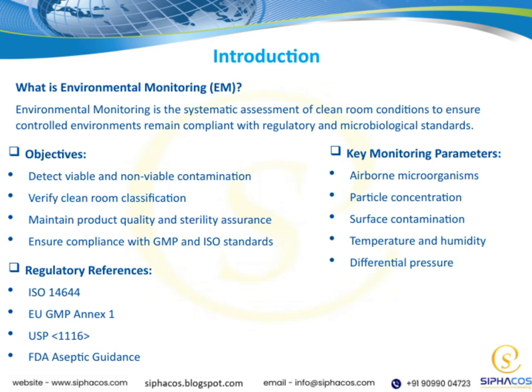By monitoring effectively, we help prevent contamination that could impact product safety. And of course, compliance with GMP and ISO standards is essential to meet regulatory requirements and ensure consistent quality across our operations. Moving on, we'll look at the regulatory references that guide our practices: ISO 14644, EU GMP Annex 1, USP 1116, and FDA aseptic guidance. These documents set the benchmarks for our environmental monitoring programs.